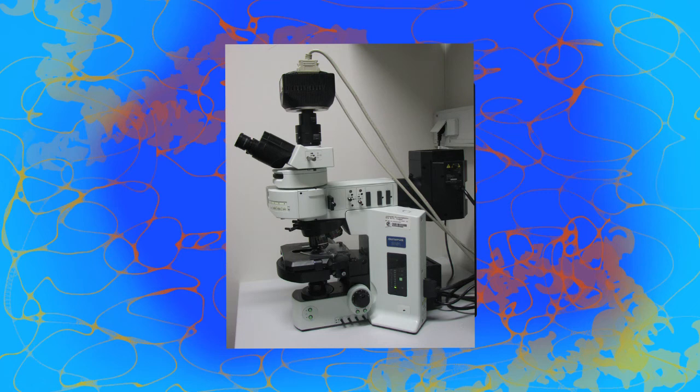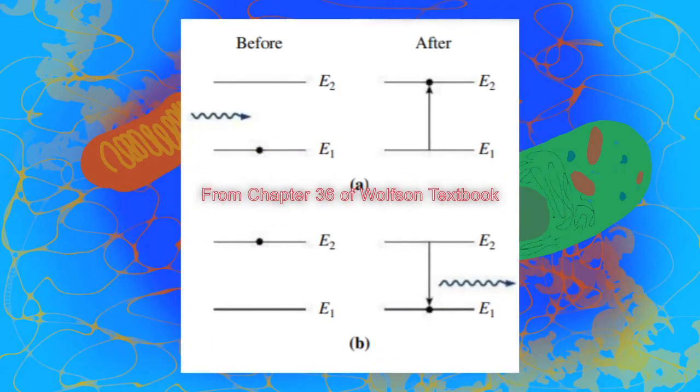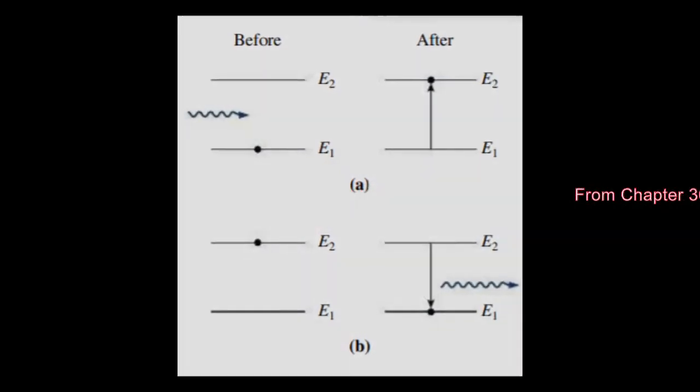Just like normal microscopes, fluorescence microscopes are used to visualize small-scale phenomena such as cells or the organelles within them. However, fluorescence microscopes have one small wrinkle. They use optical emission to highlight structures of interest. What the heck is emission?